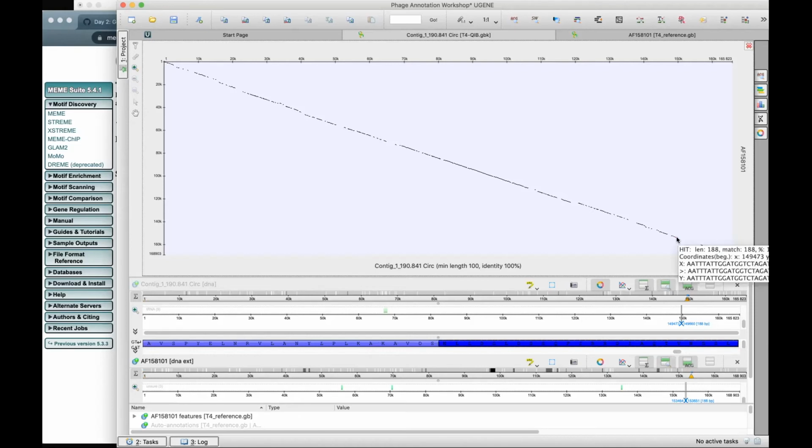One of the things that T4 is kind of known for is that it has kind of hyperplastic regions. T4-like phages have regions that are more prone to be mutated or different between different phages, because it's a very large genome, and as you have seen, it's not in this very rigid setup of a whole operon of early genes, middle genes, and late genes.